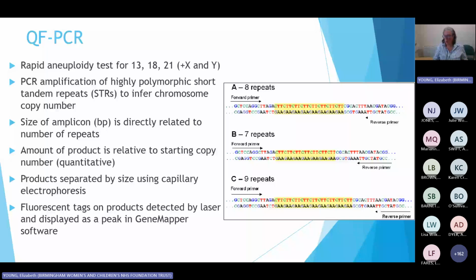But say on one of my chromosome 21s, for a marker, it's really sad I know the names of the markers, D21S226, you don't need to know that. But for one marker on chromosome 21, I have 50 repeats. On the other one of my chromosome 21s, I have 25 repeats. I'm going to get 2 different PCR product sizes representing that repeat.